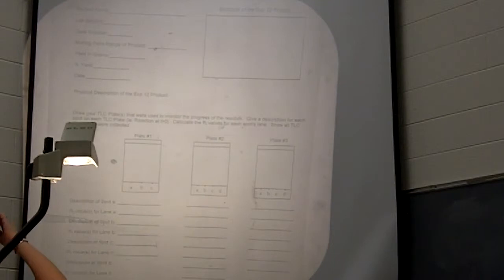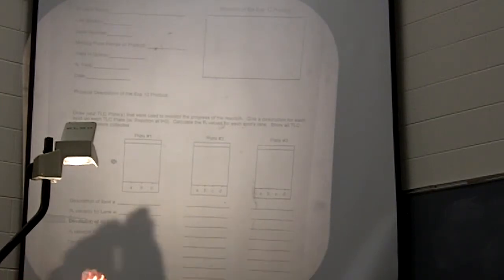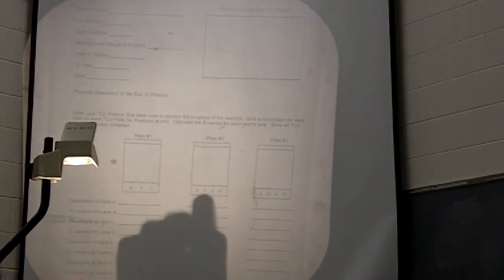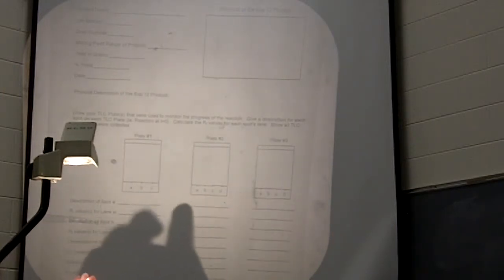Another thing you'll want to do with the TLC plates before you develop them is look at them under the UV light to make sure you have enough spotted on the TLC plate, or to make sure you don't have too much spotted. You want little spots, not big blobs, but you want enough that when you develop it, you can see what's going on. So I recommend that before you develop your plates, you look at them under the UV light. If you're not sure, ask your lab prof or your TA, they'll help you, okay?